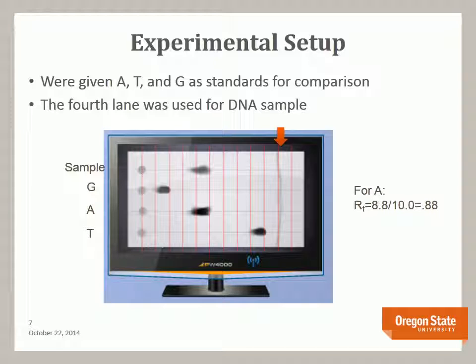However, it is always best to calculate the RF values for each sample as well as each control. Once the RF values are determined for this solvent, then the controls do not have to be rerun, even though the instructions do emphasize that you should rerun them.